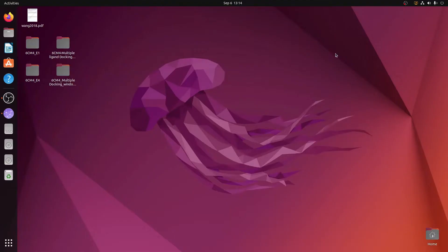Welcome back to my unplugged sessions. In this session I will explain how you can correctly install UCSF Chimera into your Linux system, and once you have made use of the entire program, if you want to uninstall it, what is the correct procedure.